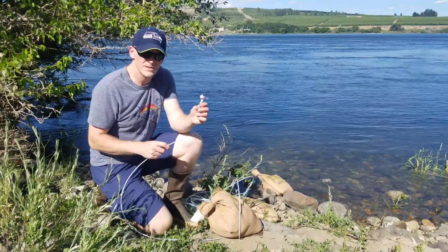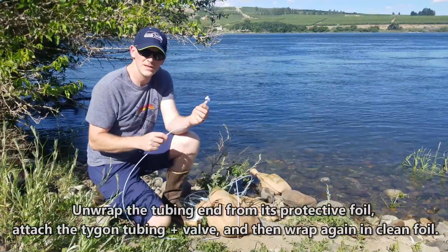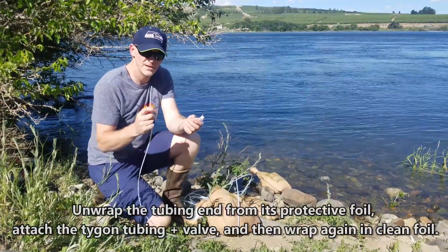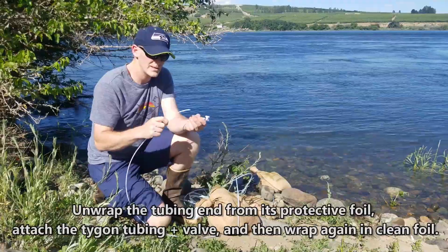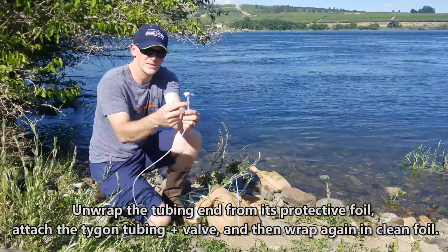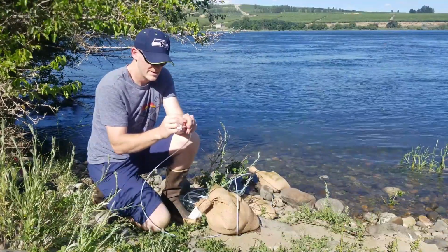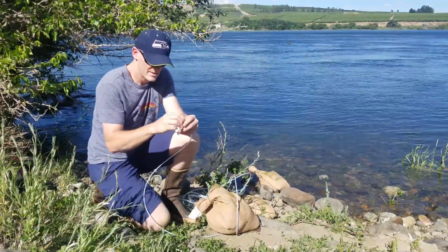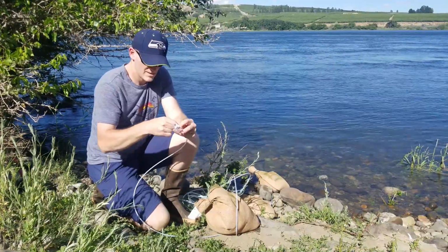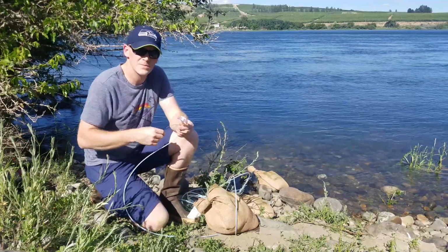One of the next things to do is attach the connector that we'll use to go from this thinner tubing into the syringe and filter housing. The white tubing is going to go right inside the soft tubing here. Push it all the way in so it touches the connector, and then zip tie. Make sure that zip tie is good and tight, with a good seal. You might even put 2 zip ties on there.